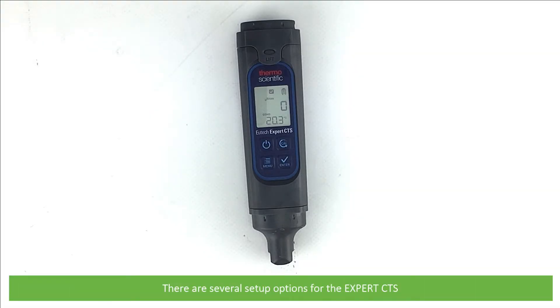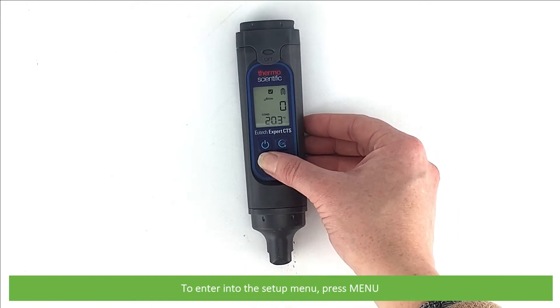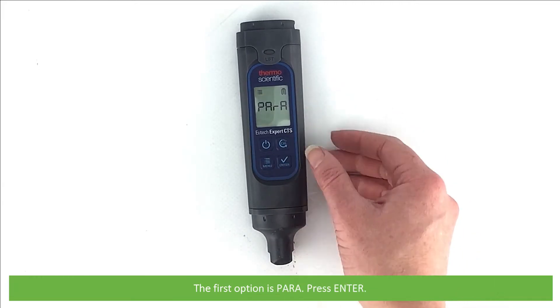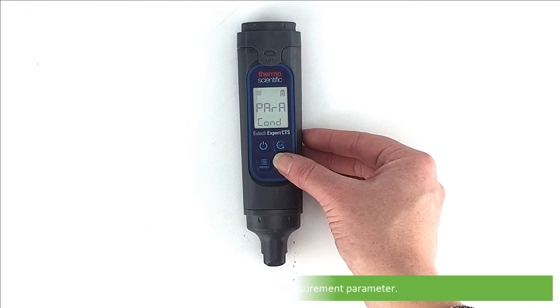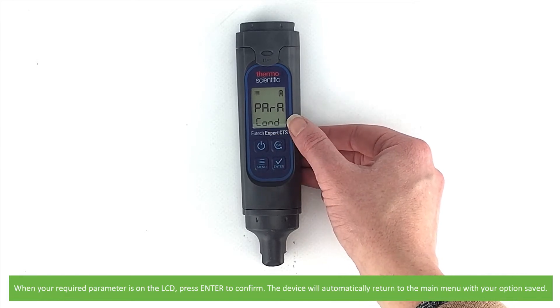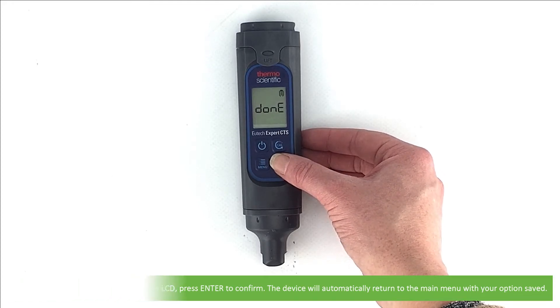There are several setup options for the Expert CTS. To enter into the setup menu press Menu. To cycle through the menu press the Menu key, and to enter into submenus and selection options press Enter. The first option is PARA — press Enter. Here you can select your measurement parameter. Press the Menu key to cycle through conductivity, TDS or salinity. When your required parameter is on the LCD press Enter to confirm. The device will automatically return to the main menu with your option saved.